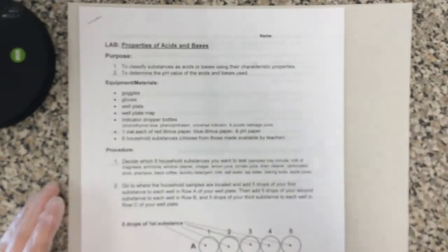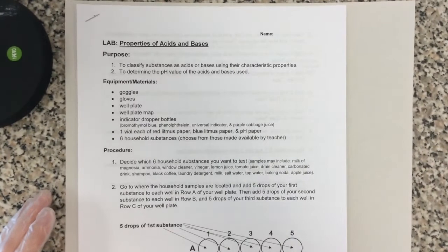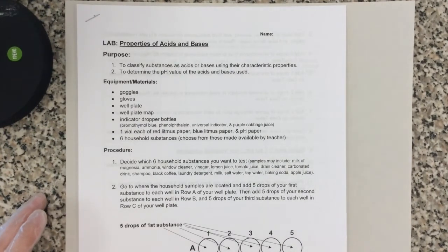All right, so to do this lab, you are going to need this handout right here. You can either print it off on Google Classroom and follow along with us that way, or you can also digitally complete it online as you are watching this video. Okay, so let's follow along and see what we need to get.